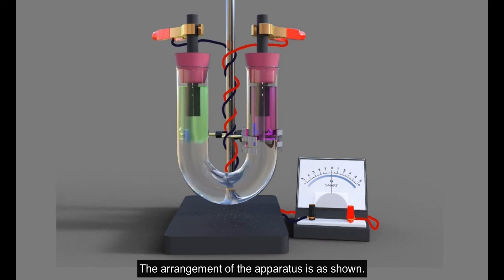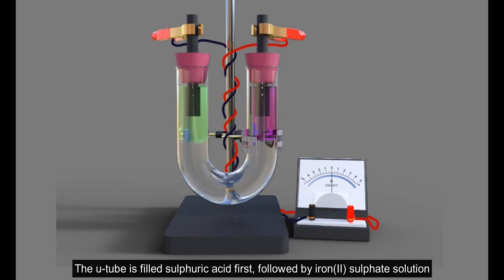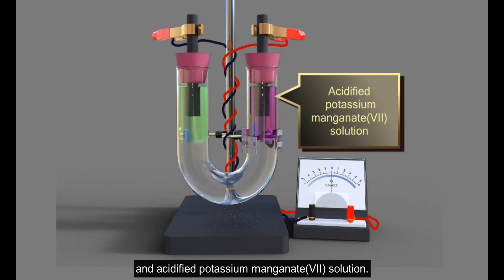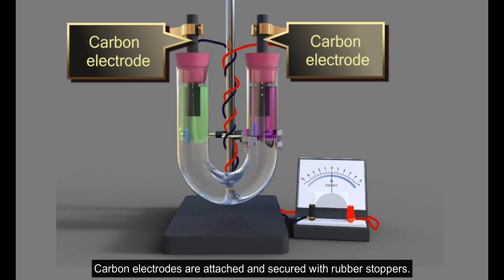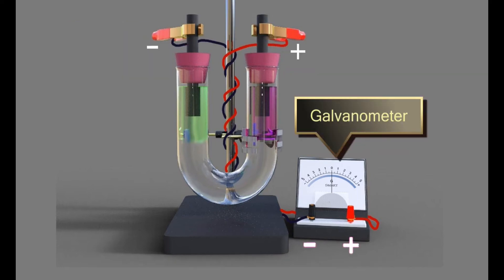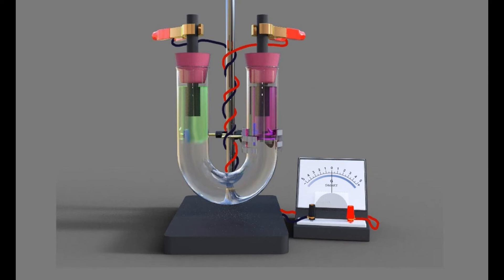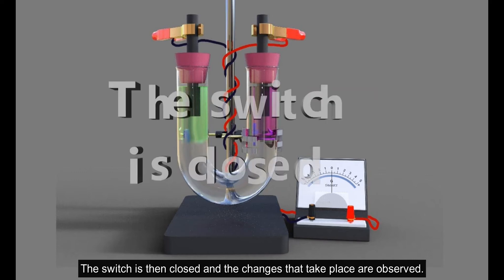The arrangement of the apparatus is as shown. The U-tube is filled with sulphuric acid first, followed by iron(II) sulphate solution and acidified potassium permanganate solution. Carbon electrodes are attached and secured with rubber stoppers. The wires are connected to the galvanometer. Colors of the solutions and the condition of the galvanometer pointer are recorded. The switch is then closed and the changes that take place are observed.